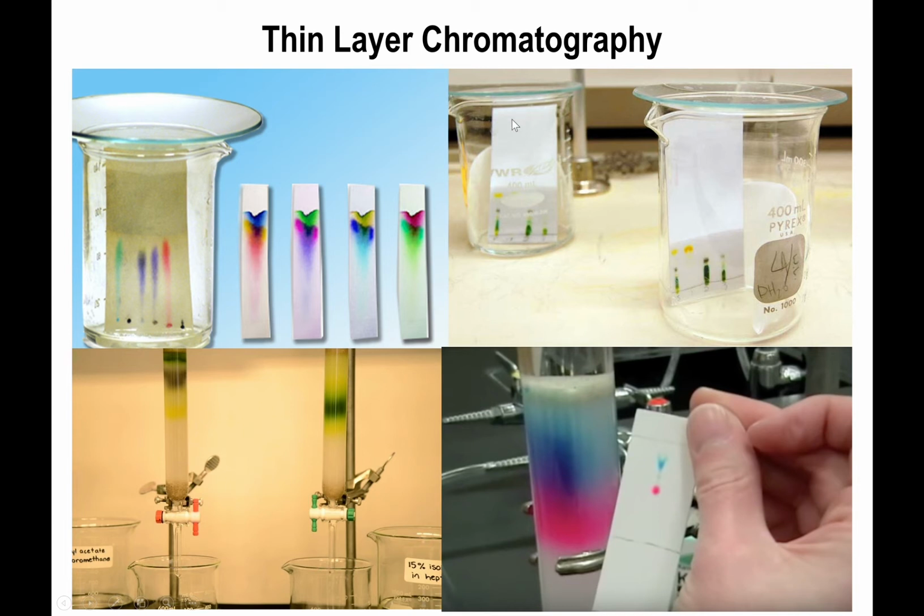So technically you have these plates, we call them thin layer chromatography plates, and you place your mixture at the very bottom. Now that plate is in direct physical contact with a solvent. That could be a mixture of different kinds of solvents, or it could be just a regular solvent, period. But what happens is that the plate starts absorbing that solvent via capillary action, and it does so until it basically reaches the top of the capillary.